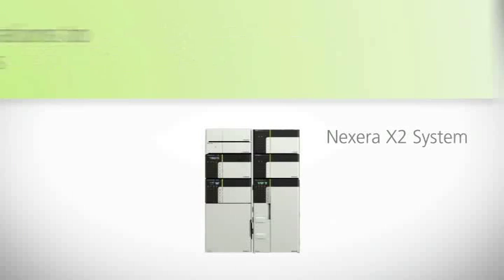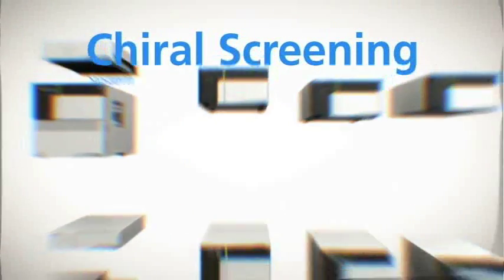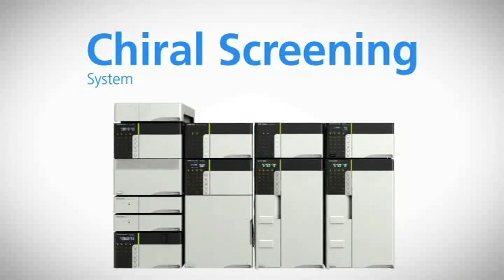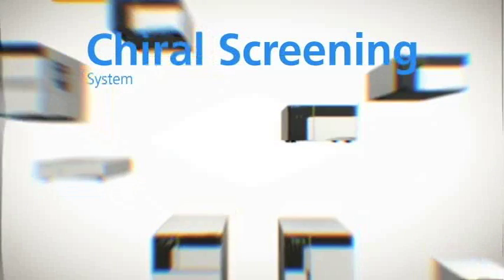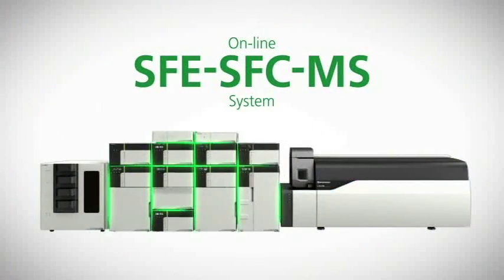Nexera UC systems can be configured by combining Nexera X2 components and dedicated units. Based on your analytical needs, you can create an optimal Nexera UC system — such as a simple supercritical fluid chromatography system, a chiral screening system that assists method development by screening 12 columns and 4 modifiers, an SFC-MS system with high resolution separation, ultra-high speed MRMs and high sensitivity detection, and an online SFE-SFC-MS system that provides a fully automated analytical workflow from sample preparation to separation and detection.